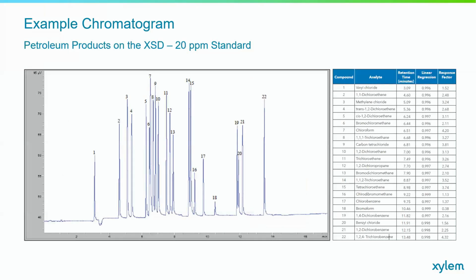So recently there's been an increase in interest in the detection and removal of organic chloride species from petroleum products. You have crude oil that's distilled to form naphthas. And then with continued refining, those products go through catalytic reforming. They produce reformates. These reformates are used in many products, including gasoline blending stock and aromatic bulk chemicals, so that it's a crucial process. And during that process, catalysts are conditioned with organic chlorides. And if you don't remove those organic chlorides, they can cause corrosion and poisoning catalysts for petroleum refineries.